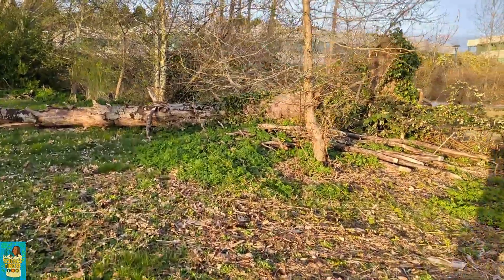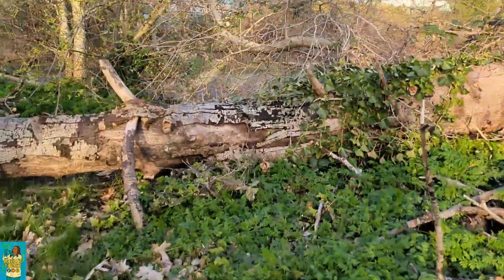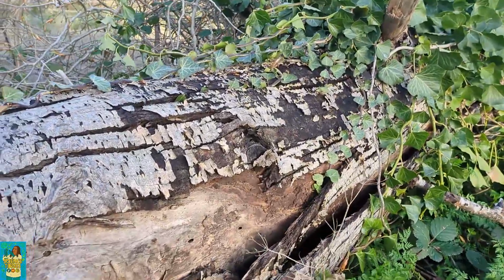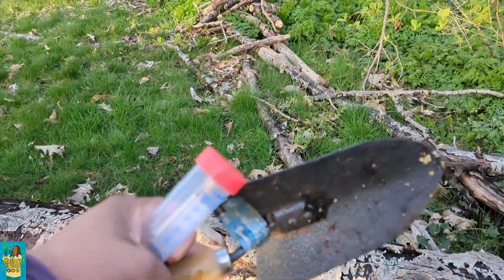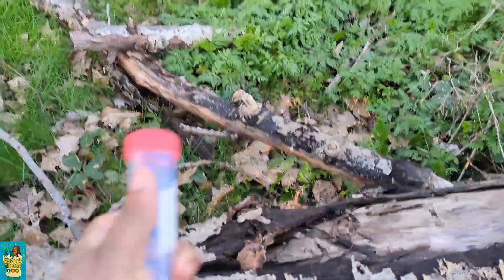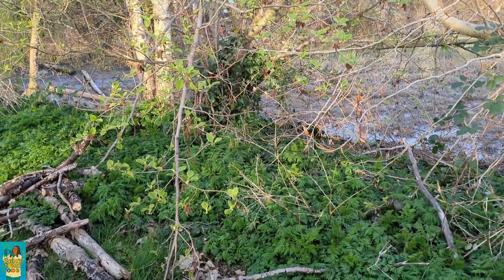I'm going to look for whitish discoloration on the tree bark. I don't see any, but I'm still going to sample a piece of the tree bark. So I brought my trowel and my falcon tube to collect the sample. I might go over there to find the roots too.